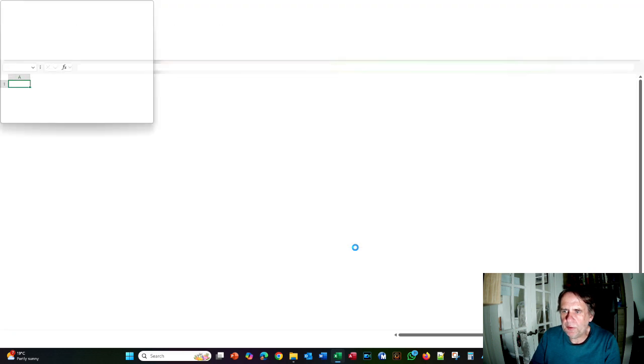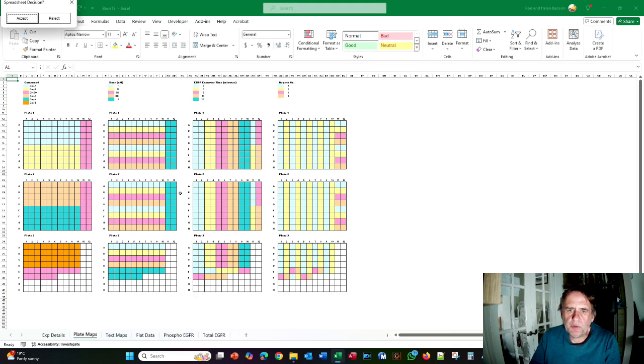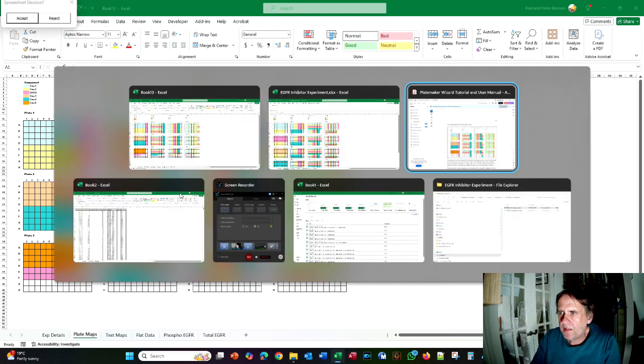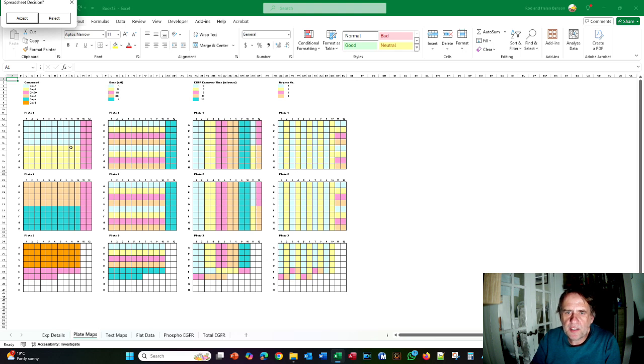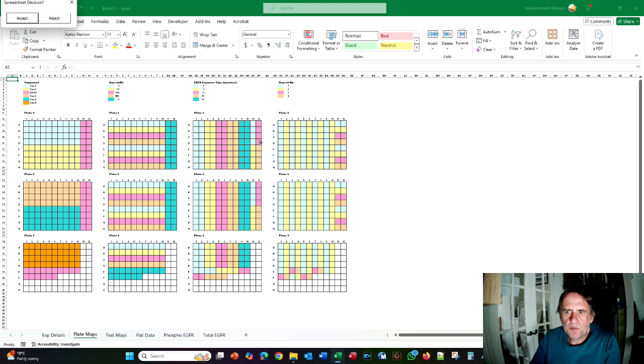And when we click preview, what do we get? So you can see we have pretty much transformed the plate layout into something very similar to our instruction manual, but not quite. If you notice, there is some slight difference. So first of all, you can see the controls aren't in these squares. We can easily fix that. We've just got to change it from column layout in the controls to row layout in the controls. And also we have this same interesting problem here where the last set of controls is not on the edge here, but that's because there is this space at the end because we only have 5, not 6 compounds. So let's fix both those problems now.